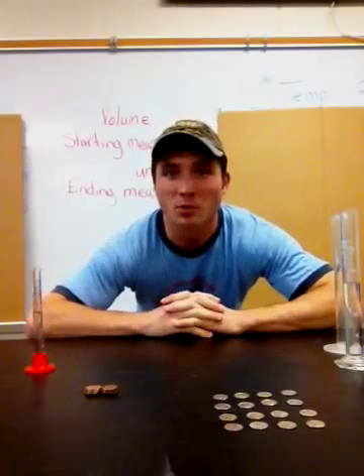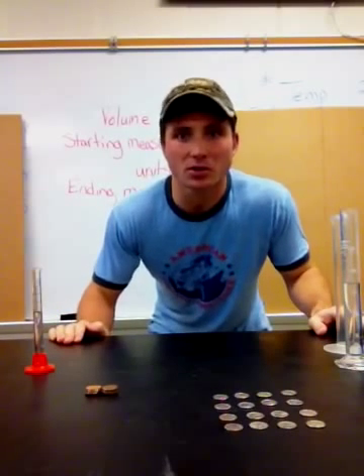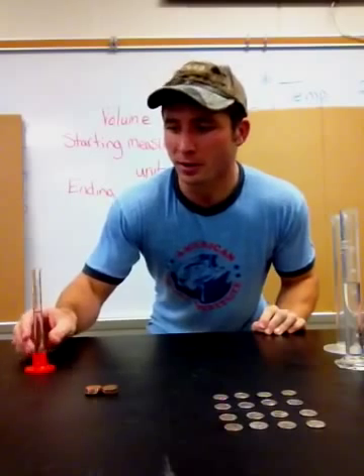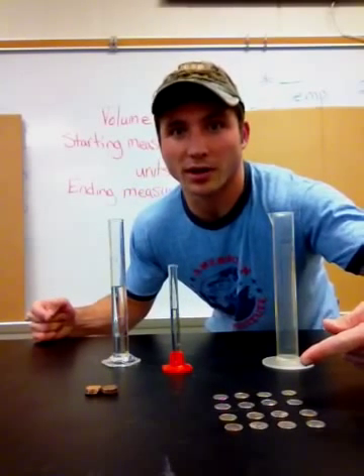Hey kids, today we're going to work on measuring volume. First of all, you're going to need a few different materials. To measure volume, we need the graduated cylinder and something to measure — I have some dimes right here.